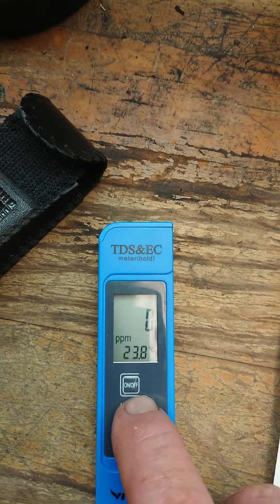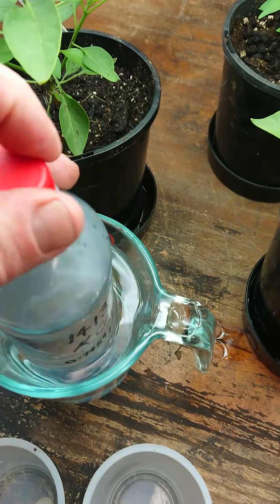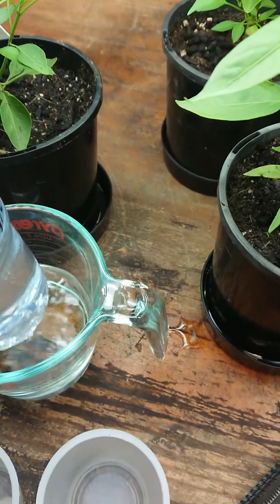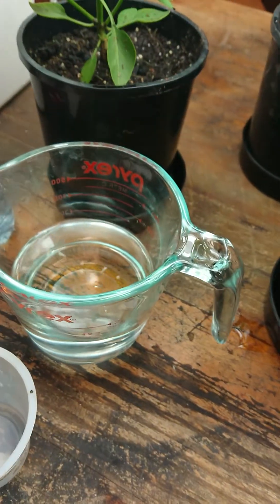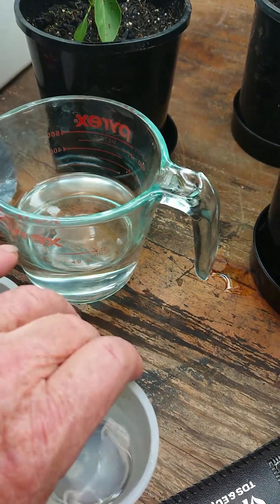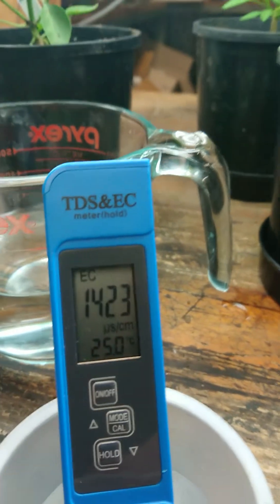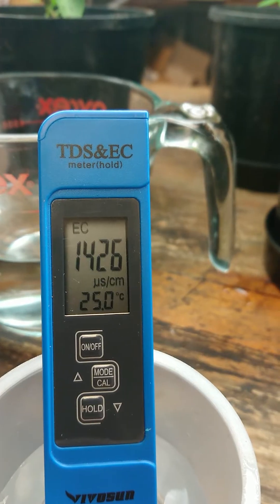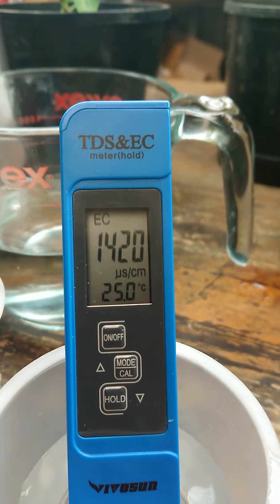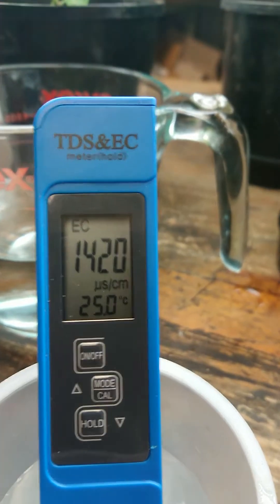Calibration must be done only in EC mode. What I'm going to do is take a small amount of my 1413 solution and pour it into a cup up to the appropriate depth so that we don't over-immerse the device, and place the unit into the solution. As you can see, I'm reading slightly high. The calibration of these meters is a little bit fiddly and doesn't seem to stay very consistent for a very long time, but it's fairly close and accurate once calibrated.